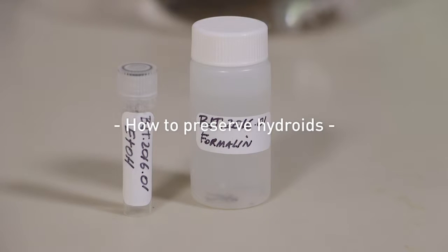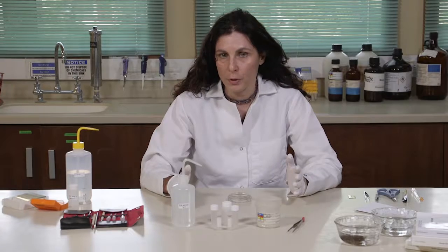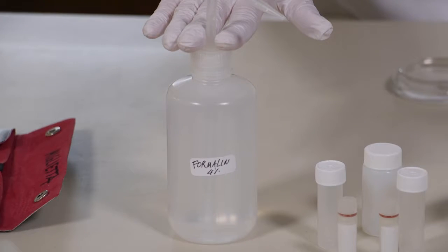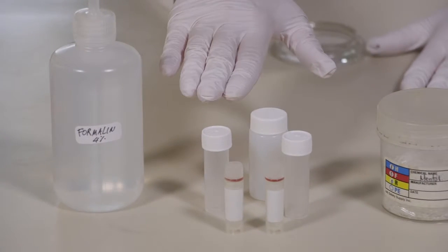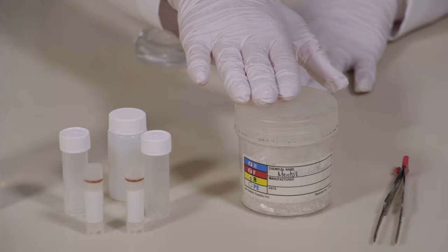Hi, today I'm going to show you how to preserve hydroids for morphology and for molecular work. Let's start with morphology. You are going to need formalin 4% — you're going to find the recipe for this formalin on the protocol below — vials of different sizes depending on your colony, menthol crystals, and tweezers.